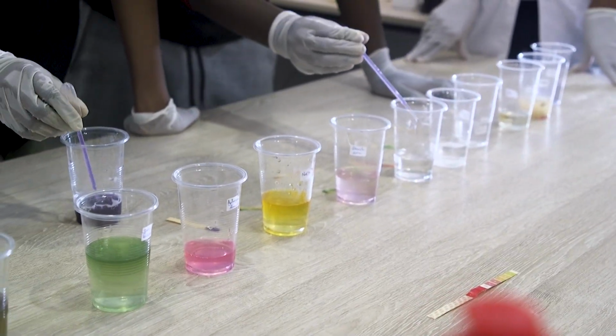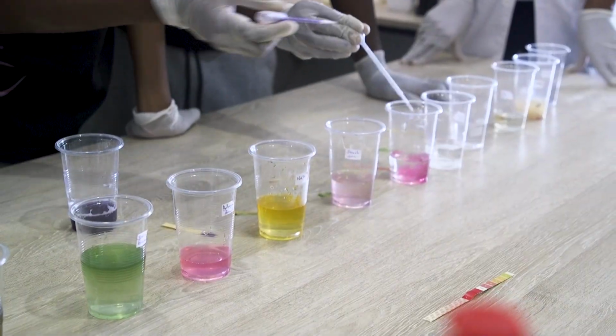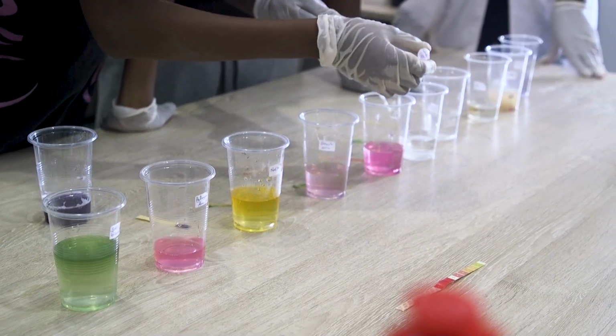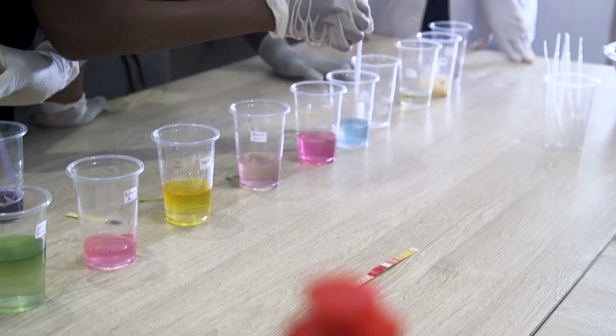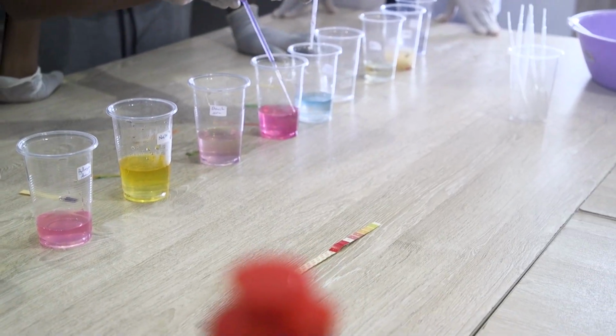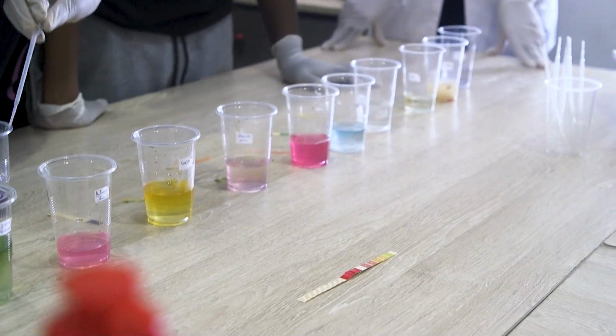Caleb, what's the color there? It's almost red. And let's test this one. Blue. That's blue, right? Good. We are determining the color of the ring.